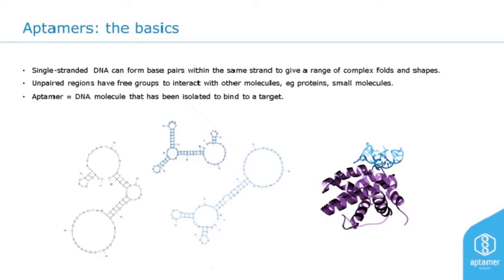Essentially, an aptamer is a DNA molecule that's structured, and that structure allows it to interact with a target. You can see an example of that on the right-hand side of the slide, a protein in purple interacting with an aptamer in blue.